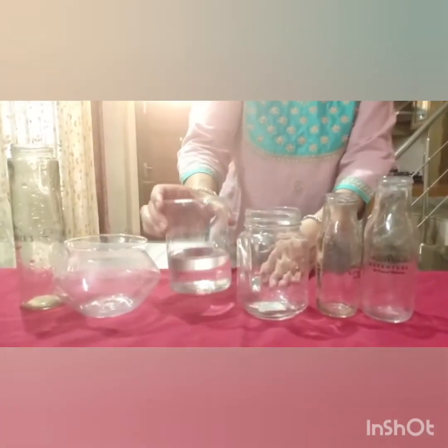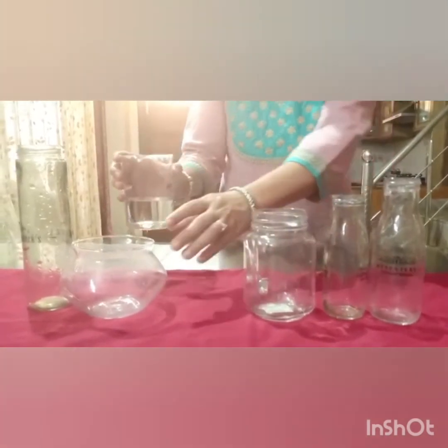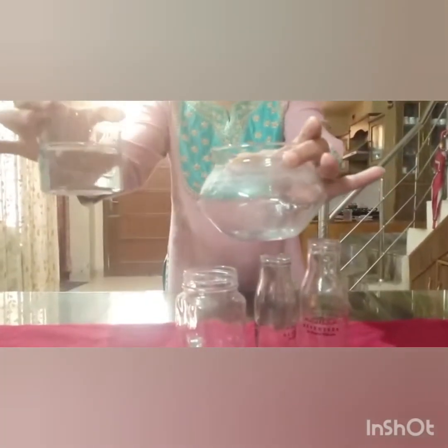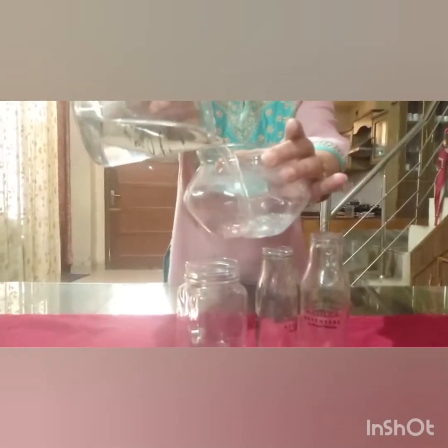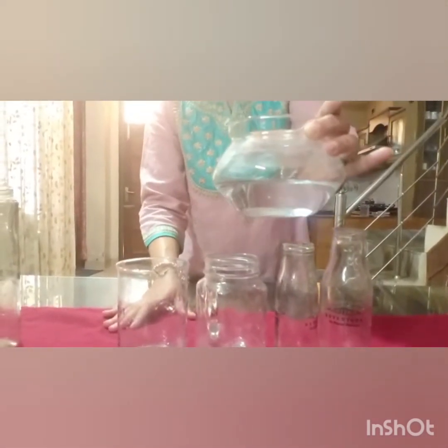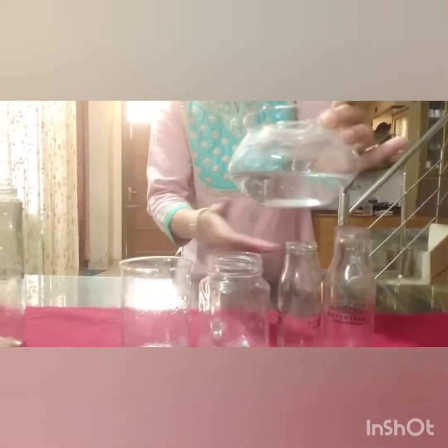It's easy to pour the liquids with the help of a beaker. Here I have a flat bottom flask also. So I'll pour this water into a flat bottom flask. So this is one more shape of water. So this is how I'm getting different shapes of water.